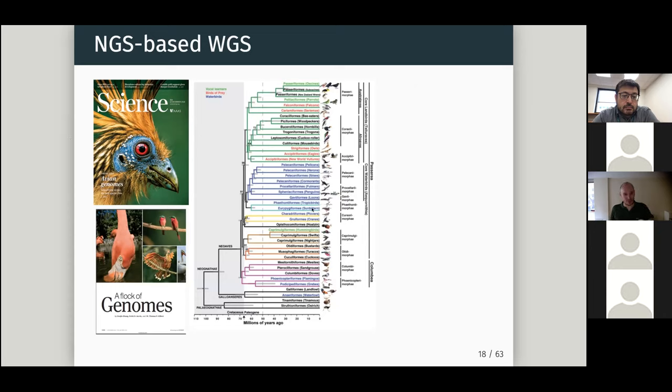So here is an example from our lab. This is from 2014, but in April we have a very big special issue in Nature coming out, with several studies and many more high-quality genomes being released. Of course, we're planning to use these genomes to understand biology, evolution, and so forth. One can think of using them to reconstruct a phylogeny of birds, which has always been a challenge because of the early branches in birds. But there are millions of other applications you can think of, and all of them usually have some alignment problem underlying.